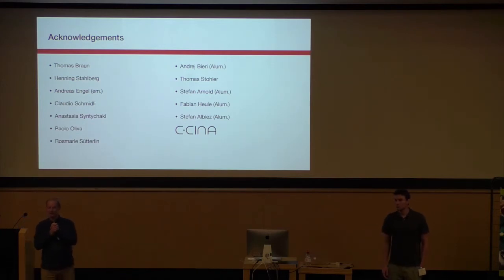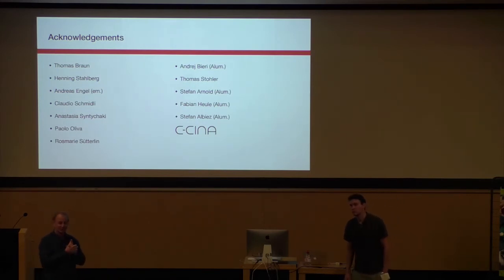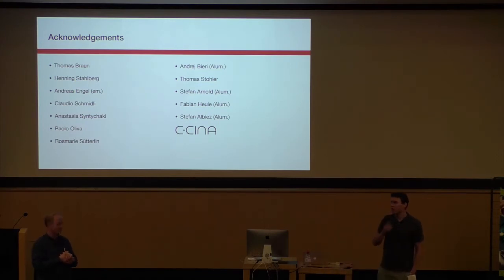Albert, maybe? How long does it take from picking up the grid to after you've written your sample to the grid to freezing? At the moment, I'm using 360 milliseconds at the moment. But that's sort of fixed. Or could you vary that? It's fixed. At the moment I cannot go much faster, but I can go much slower.